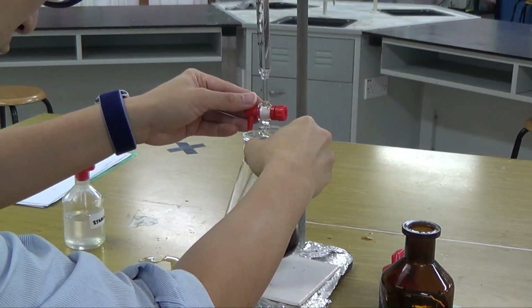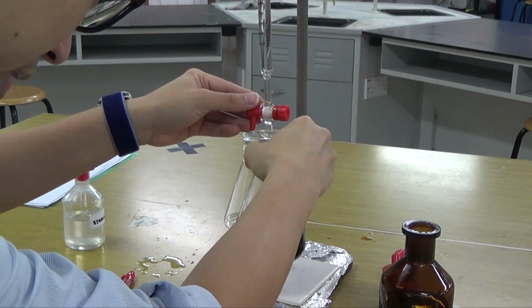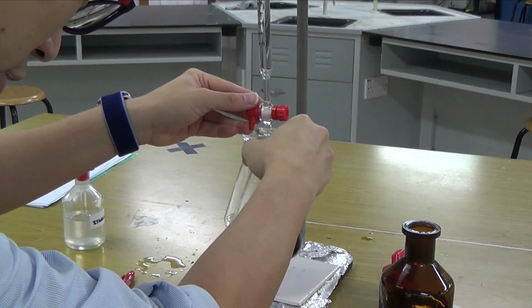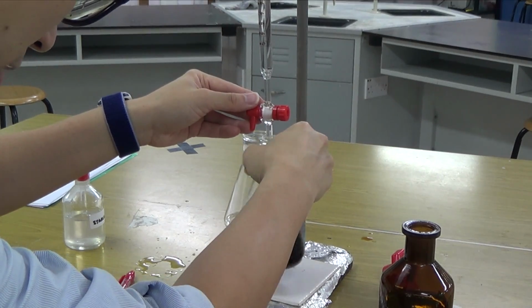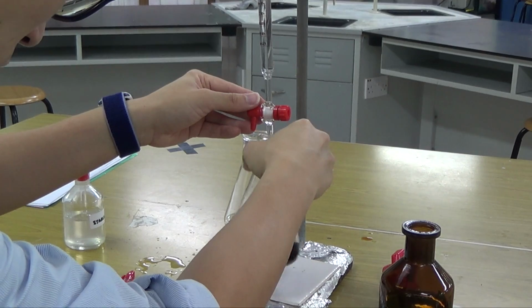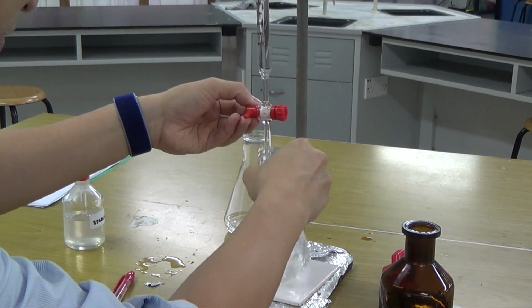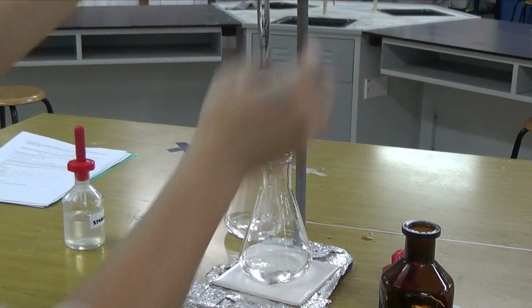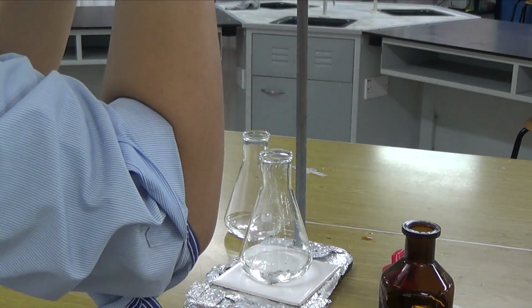So do not take your eyes off the conical flask. Don't even bother with the reading, because you are doing exact titer, so you can read the reading later when you reach the end point. And don't take your hands off the tap as well. One hand on the tap and one hand swirling. You don't need to swirl that strong, but one drop will give you the color change. I think the next drop should give me a color change. It's pretty sharp, and then I stop straight away. Okay, so now I've reached my end point.